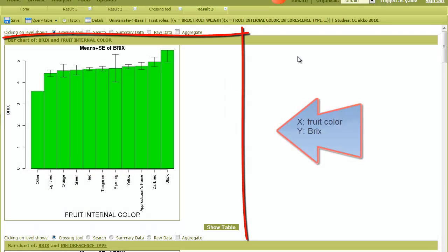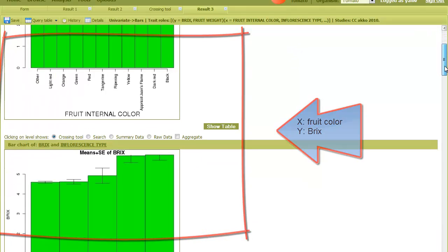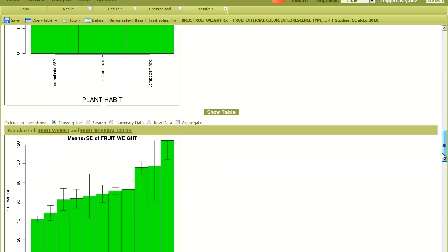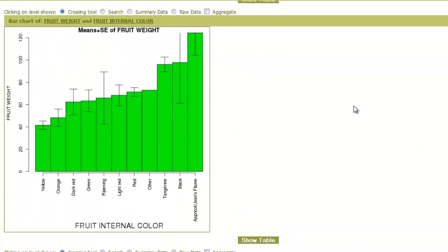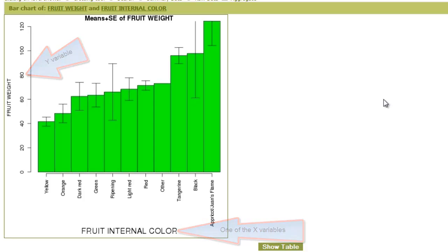The result shows a figure for each combination of X and Y variables. For example, here I can see the average fruit weight of each of the color categories.